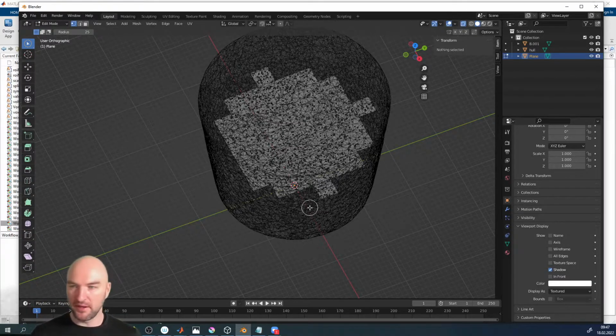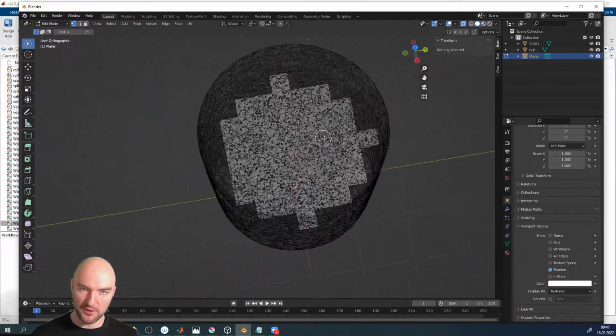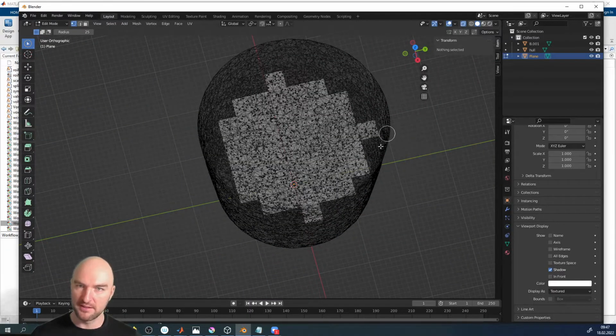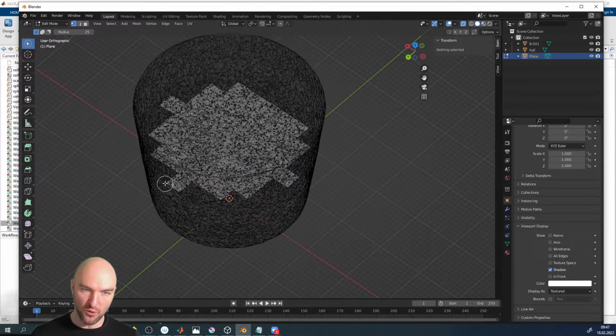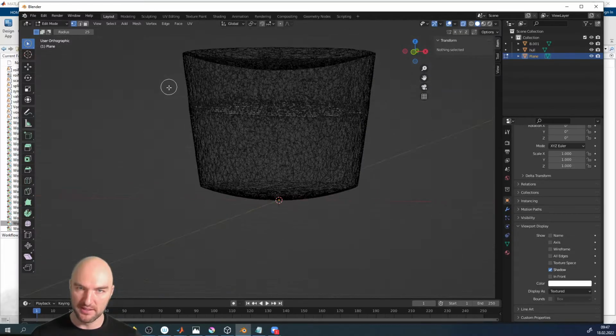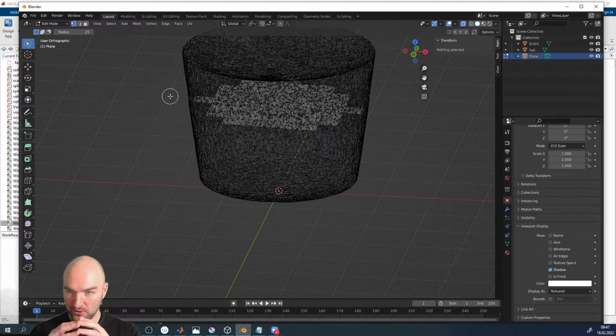Of course, if you don't do any mapping on it, because later we're going to get into mapping, and then the distance between the mesh points is going to become very, very important. Okay, and so the next step is to create a topology with that grain boundary that we can actually fit to the data domain. What we're going to do is move all of our outer vertices onto the boundary, so that our grain boundary is tied with the hull.